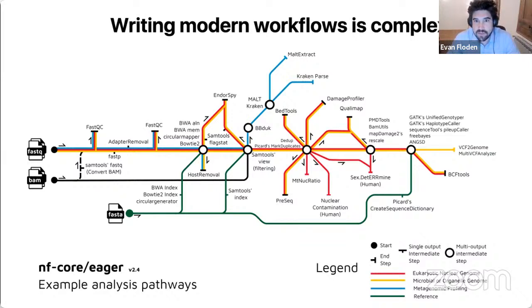If we think about some of the characteristics of this, we've got lots of different tools that we're trying to chain together, as well as orchestrate the data through that pipeline. In bioinformatics, we very often have a whole bunch of different tools from different sources. Maybe you've got something from GitHub, some script you've written yourself, maybe even some proprietary software, some containers from all over the place.